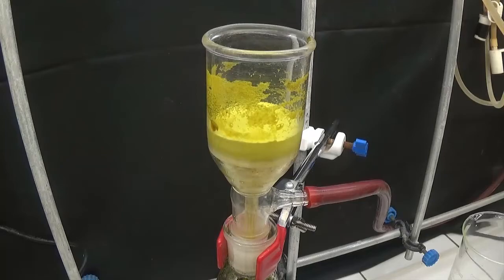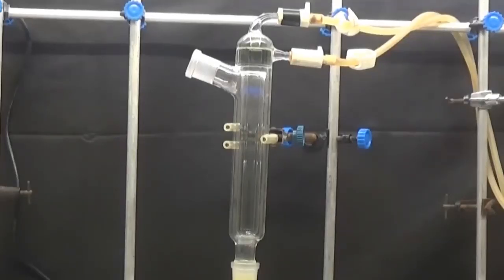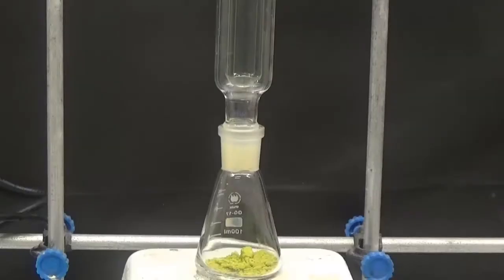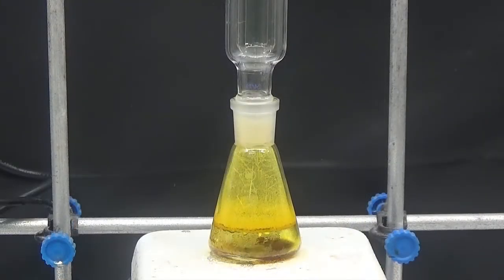For sublimation purification, we use a condenser called a cold finger, which is special for sublimation. We put a small amount of benzoquinone in a flask and mount the condenser. The flask is heated, and we can see how benzoquinone sublimates, forming long yellow needles.